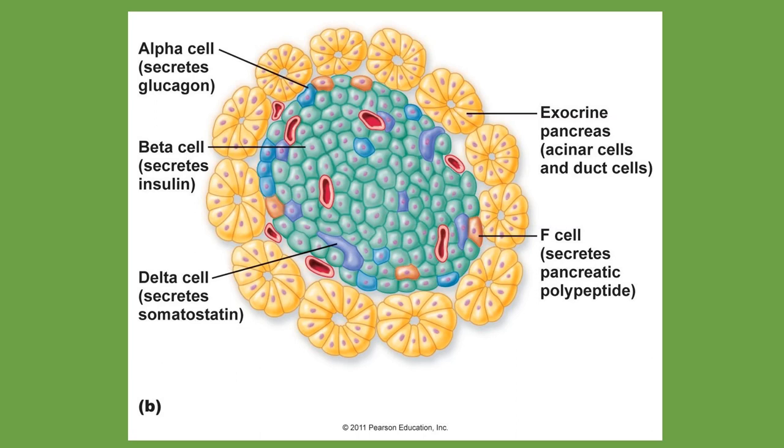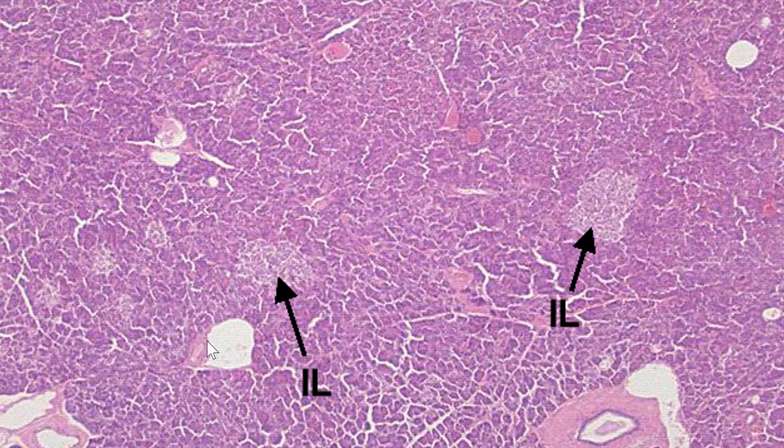So it's always easier if you have a visual of what is actually going on and what is being secreted from each, right? Here's a picture, and this one that I found already kind of highlighted these little islands, right? When you're looking at the pancreas, you want to think of it like the vast sea. And these pancreatic islands, or isles of Langerhans, are going to be those light sandy patches, right?